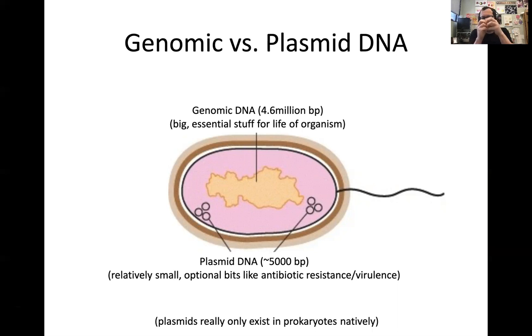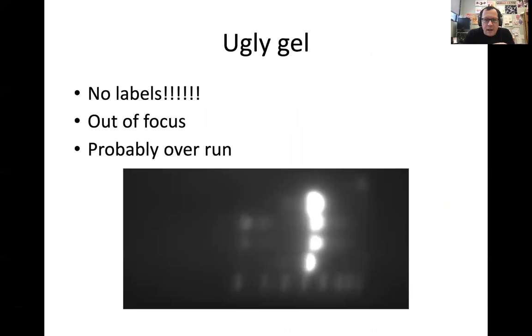What they do is, the plasmid's all coiled up. We cut it with a restriction enzyme and that loosens it, turns it linear, right? And so we'll be able to tell the difference whether our DNA is cut or not on the agarose gels.